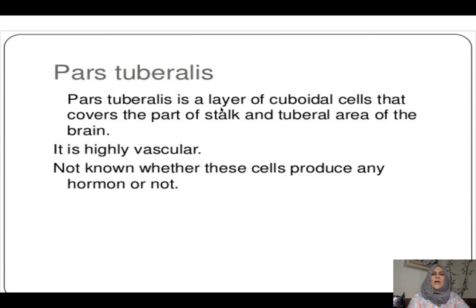This region, pars tuberalis, it is thought that it has a lot of basophils والcells مالتها they do not know till now whether they secrete hormones or not.